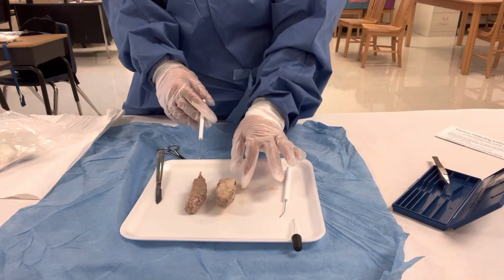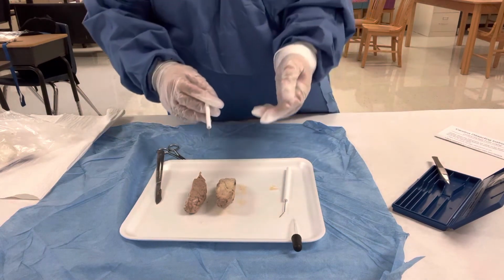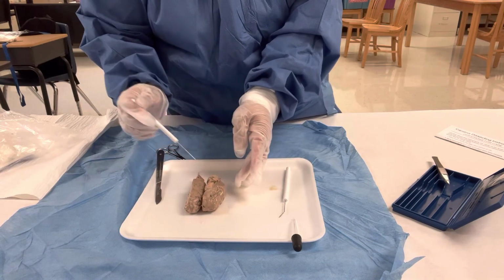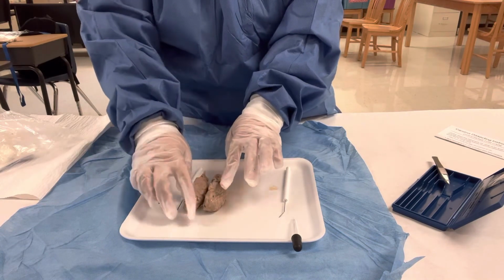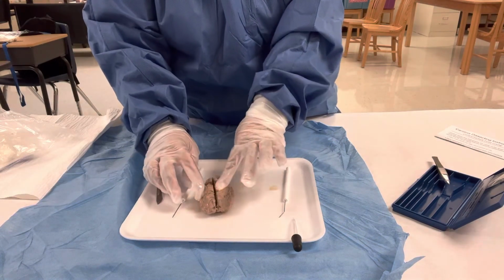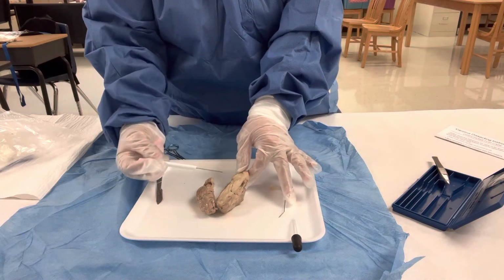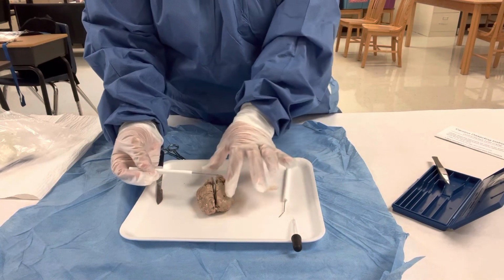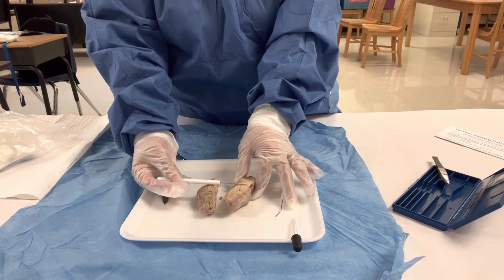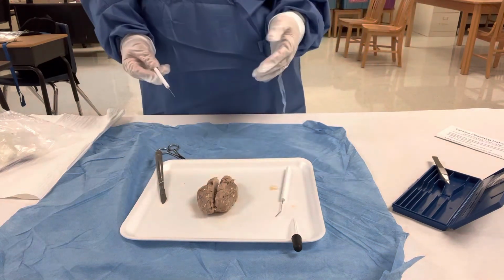Let me see. Did I do the occipital lobe? It's back on. So the occipital lobe, it would be up here, receives and interprets visual sensory messages. I think that's it.